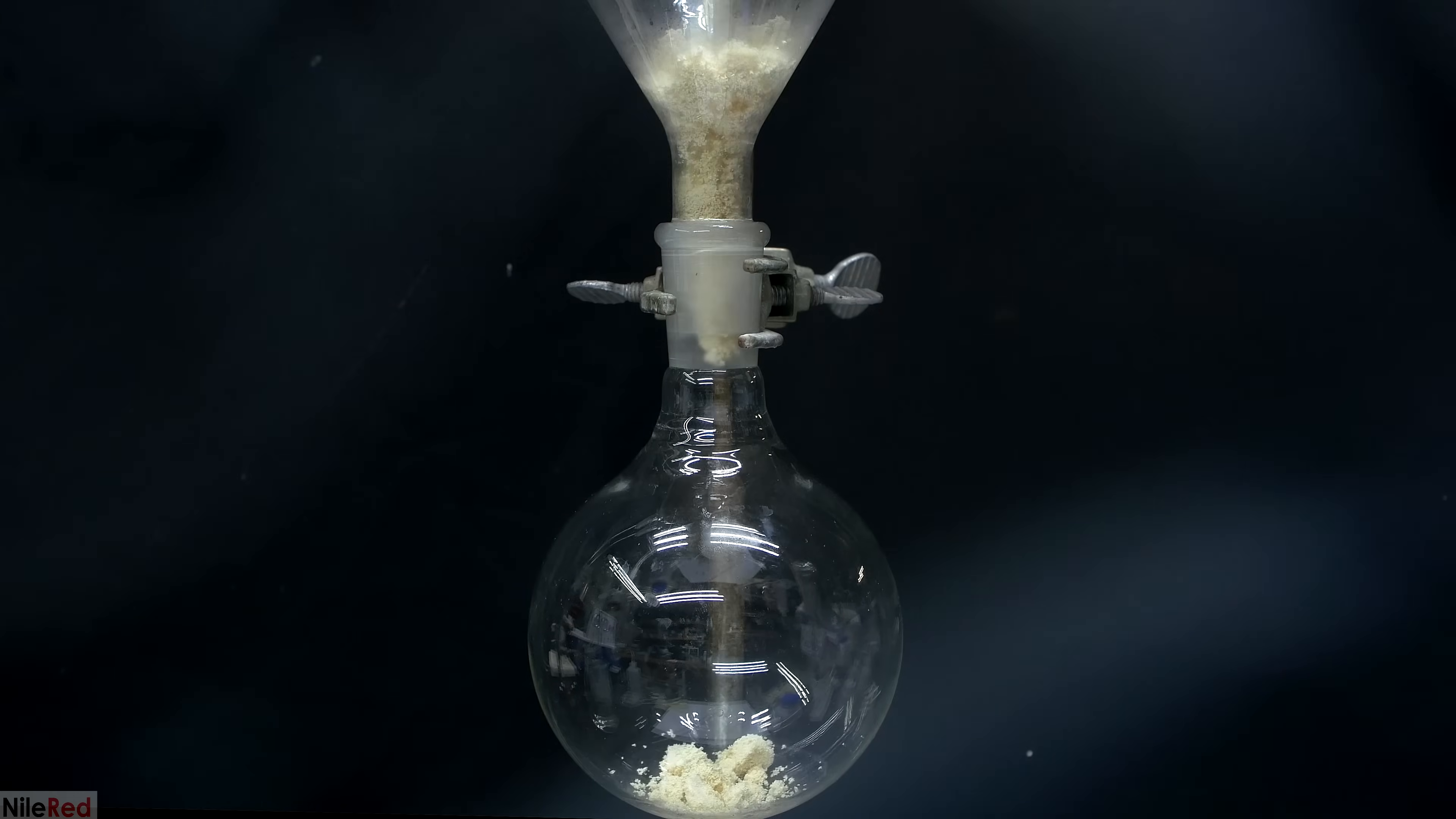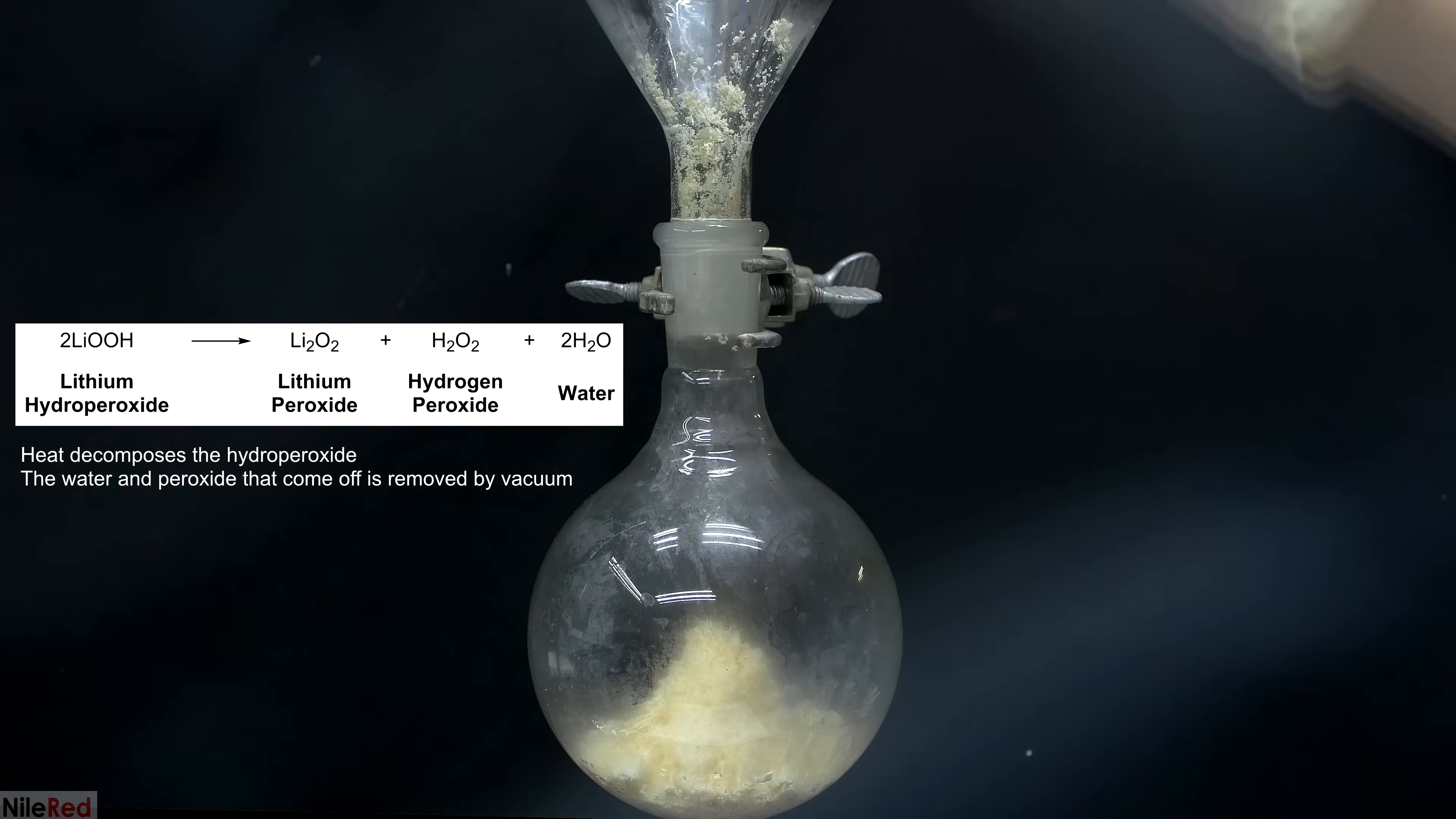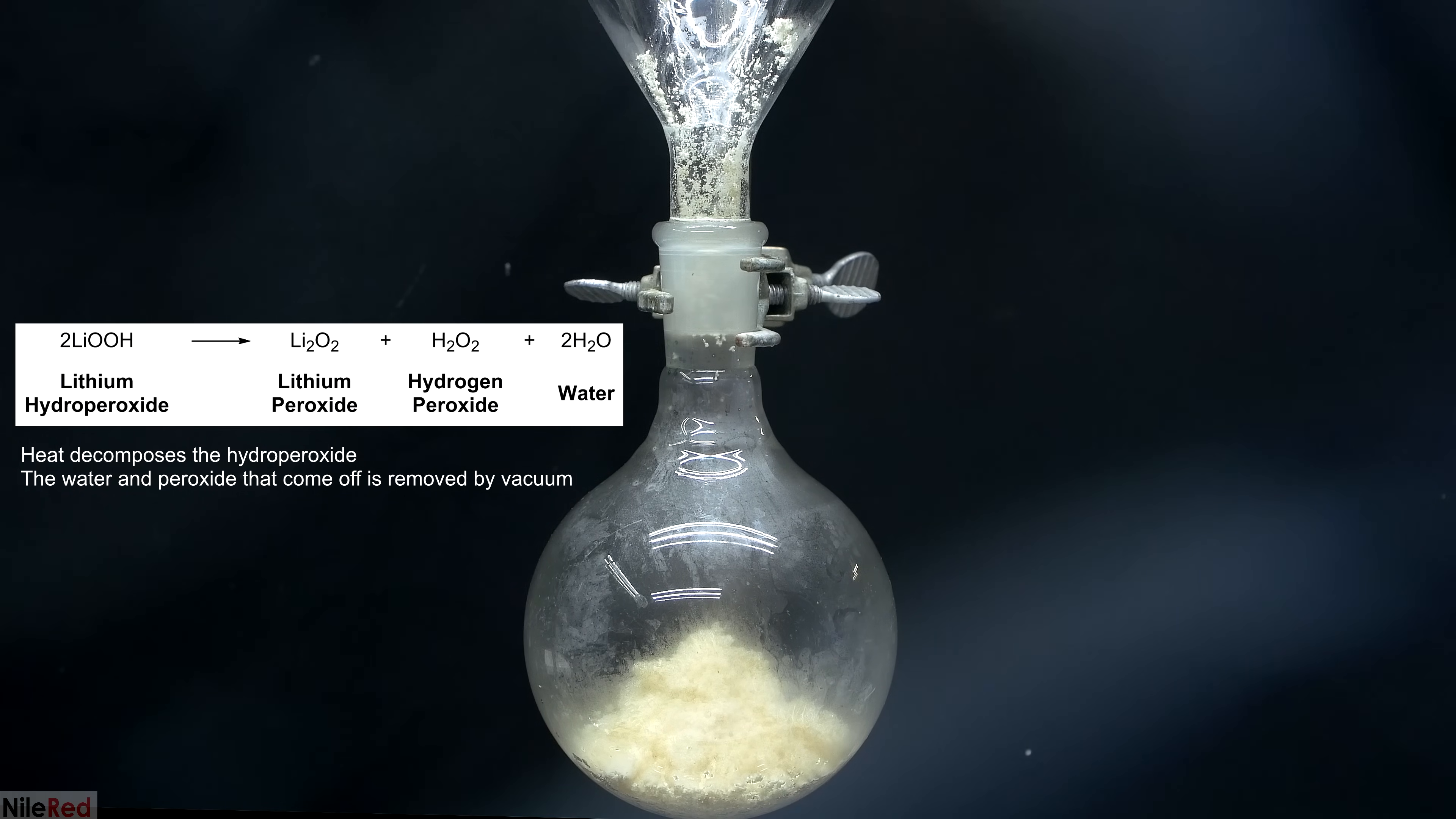The next thing that we need to do is convert the hydroperoxide of lithium into the actual peroxide that we want. This conversion is carried out by heating the lithium hydroperoxide while under a vacuum. So, what I'm doing here is transferring the hydroperoxide into a round bottom flask and then I'm going to pull a vacuum and heat it up over an oil bath.